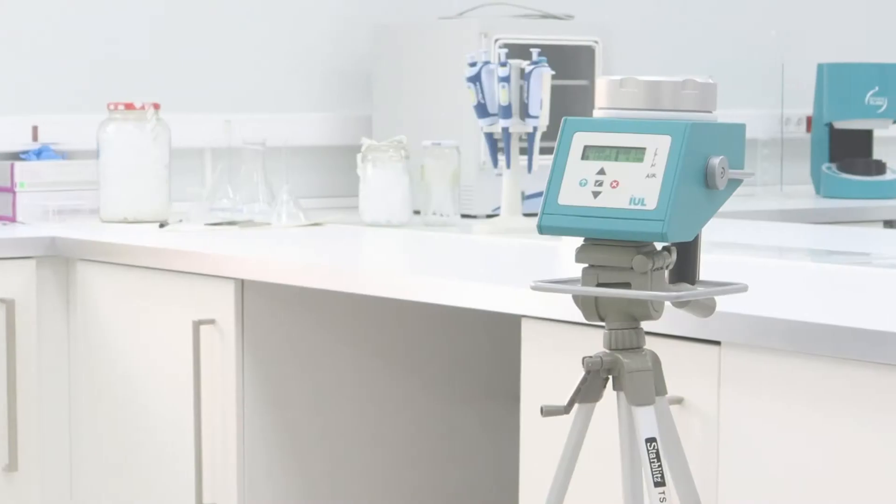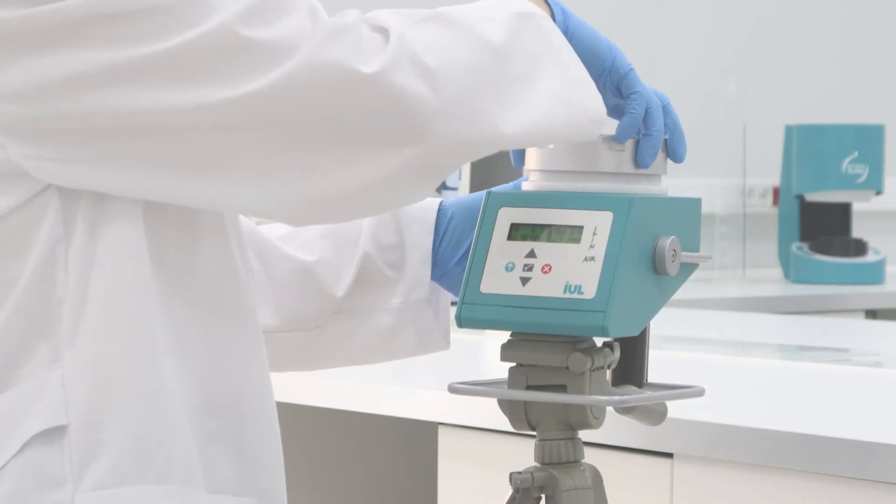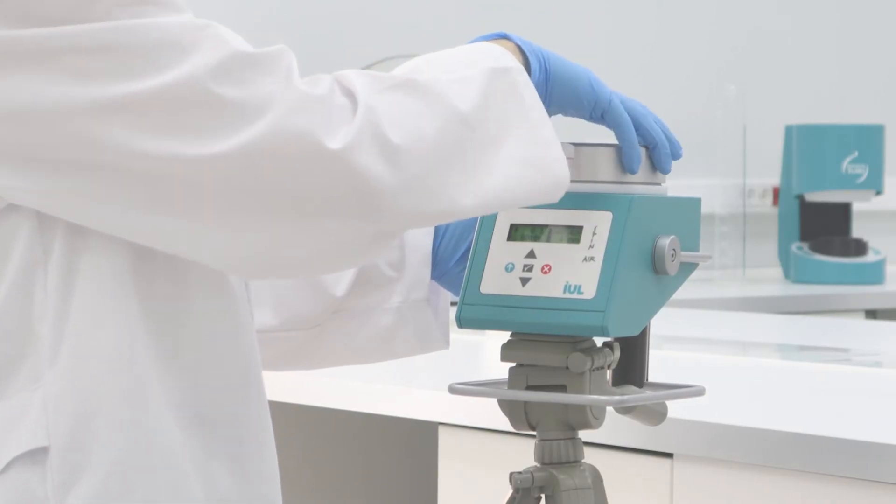This sampling technology uses 100% of the petriplate agar surface to plate microorganisms. This improves data statistical significance greatly, avoiding the use of colony count correction tables.